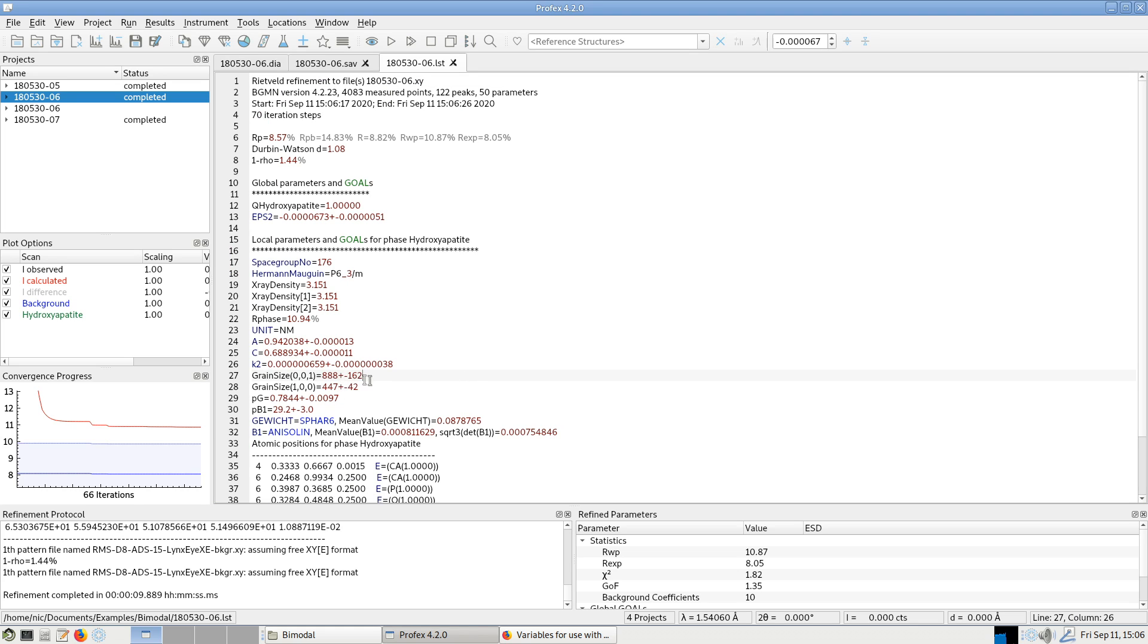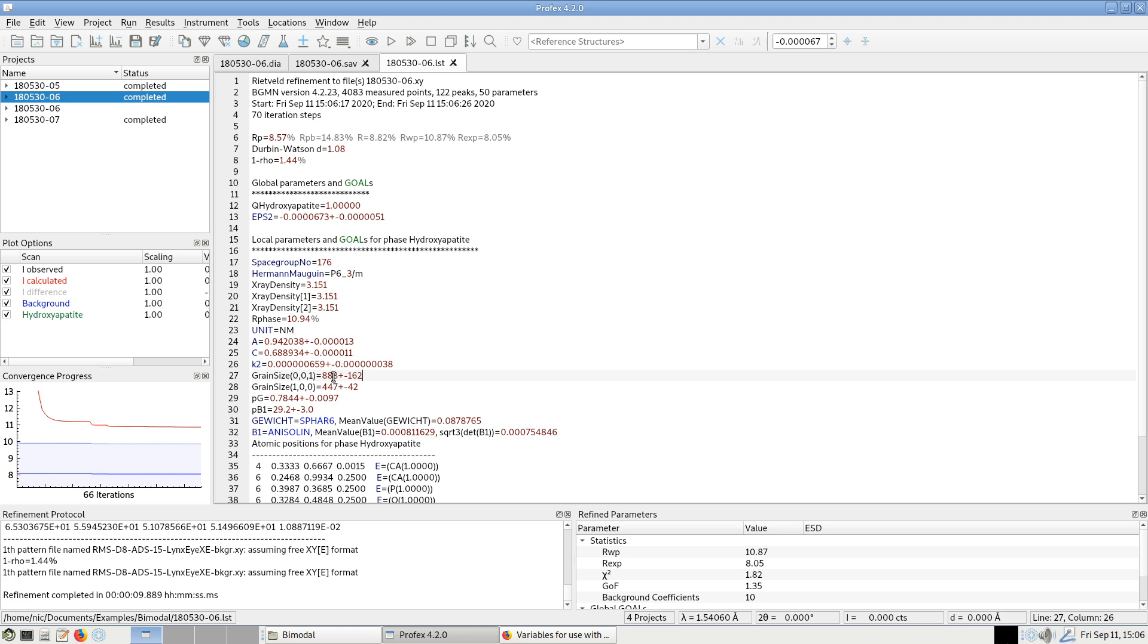In general, the amount of peak broadening of this highly crystalline phase is so low, the peaks are almost perfectly sharp, that it's difficult to refine the grain size of such highly crystalline phases. We can also see it from the high estimated standard deviation.